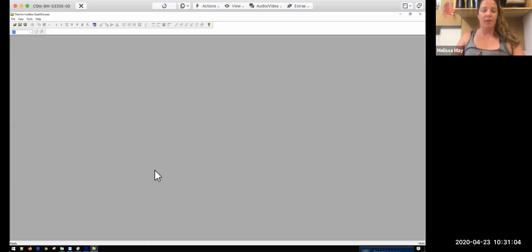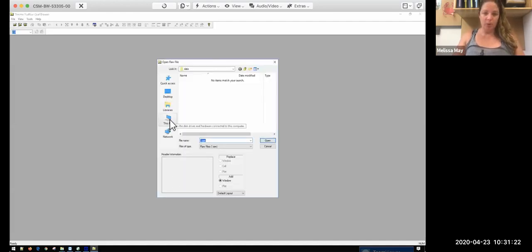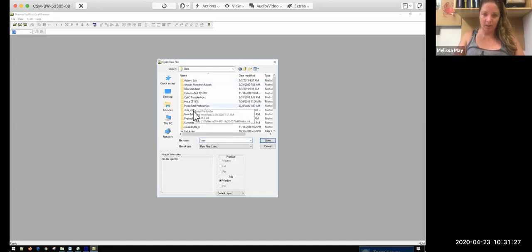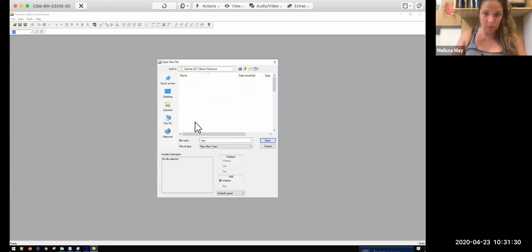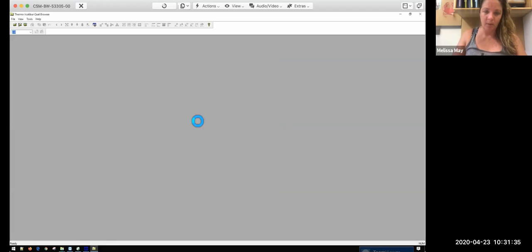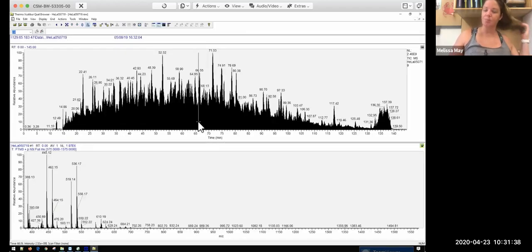The other thing to note is if you wanted to get a picture of your actual chromatogram of your different peptides eluting, this would be where you could do it. You could screenshot that, which would make really nice ones for a publication. So I'm going to try to find one of my HeLa samples. We run HeLa as a quality control to just kind of look at how things are running.